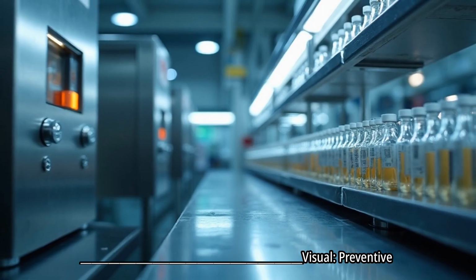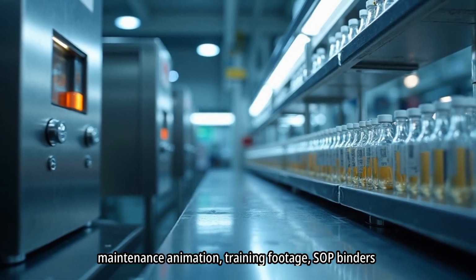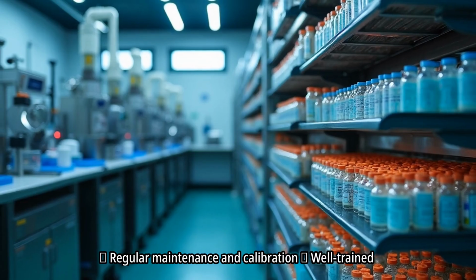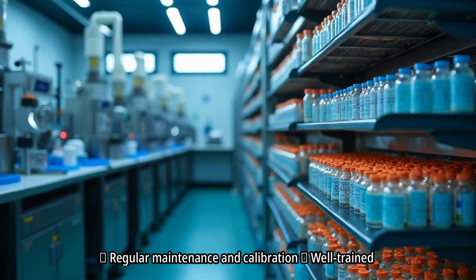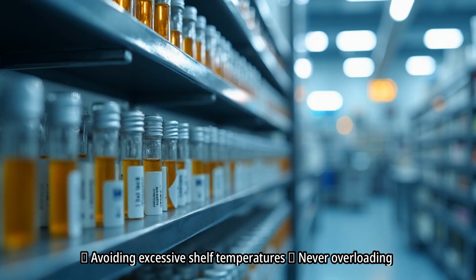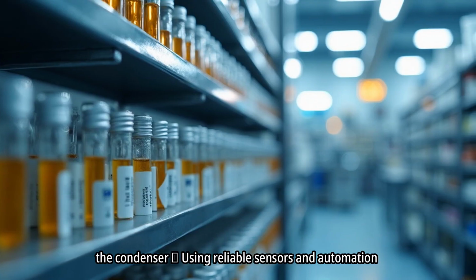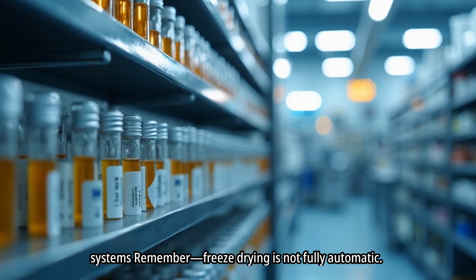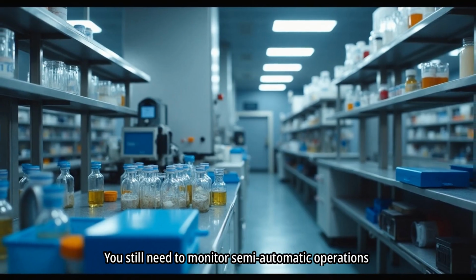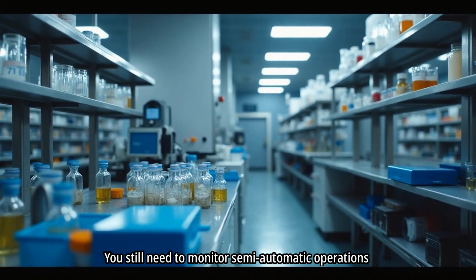So how do you prevent these issues? Regular maintenance and calibration. Well-trained personnel, accurate process controls, avoiding excessive shelf temperatures, never overloading the condenser. Using reliable sensors and automation systems. Remember, freeze drying is not fully automatic. You still need to monitor semi-automatic operations closely.